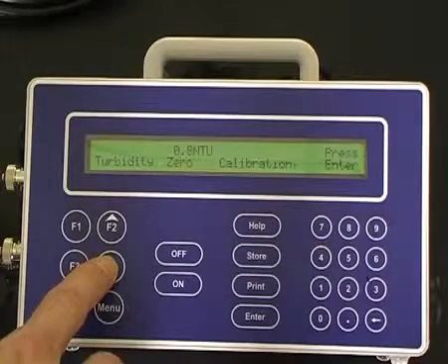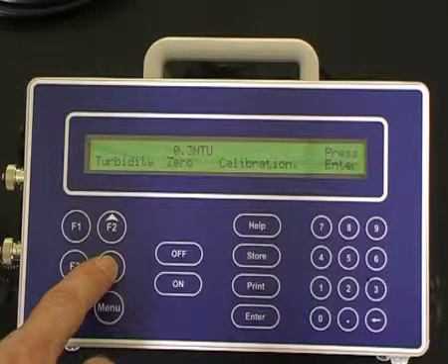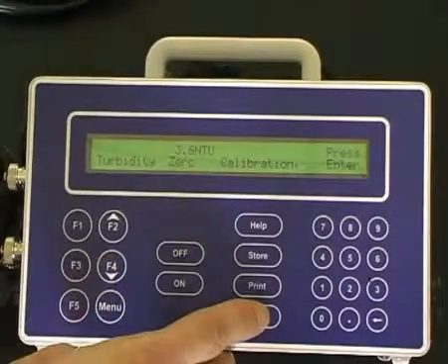For the first point turbidity calibration, which is zero in deionized water, allow the sensor to equilibrate. Once the sensor has equilibrated, press the enter button.